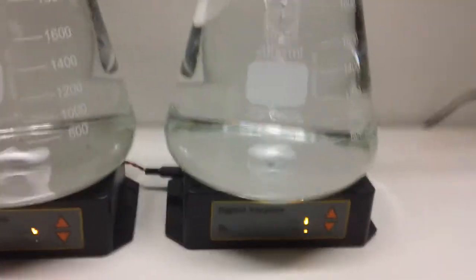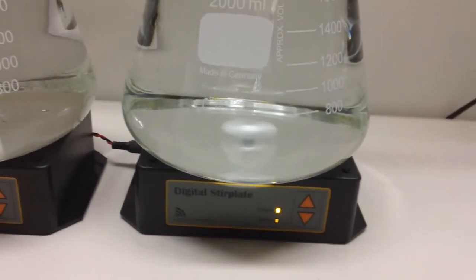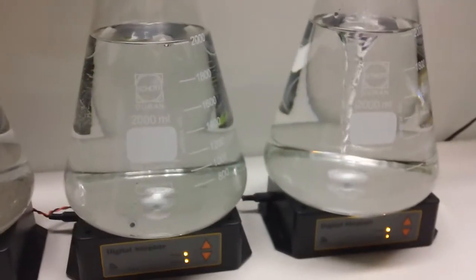I'd also note that probably most of that 1.6 degrees is going to come from the mechanical action of stirring itself which is something we can't really get rid of in a stir plate, otherwise it won't be working at all.